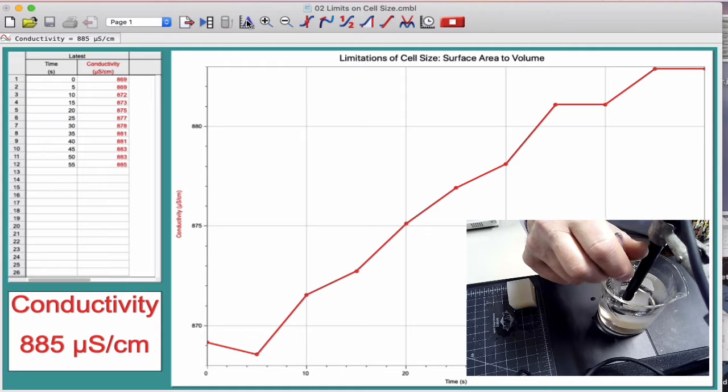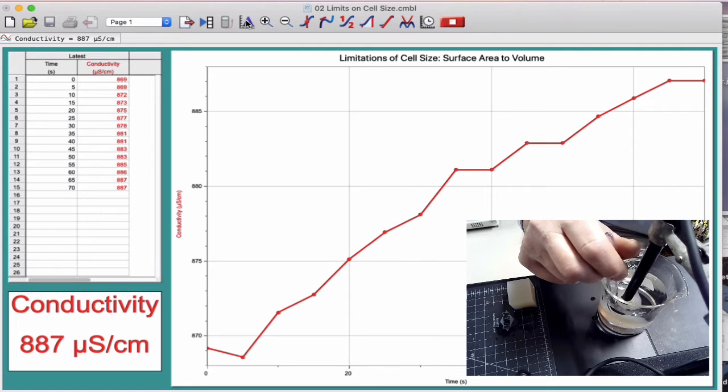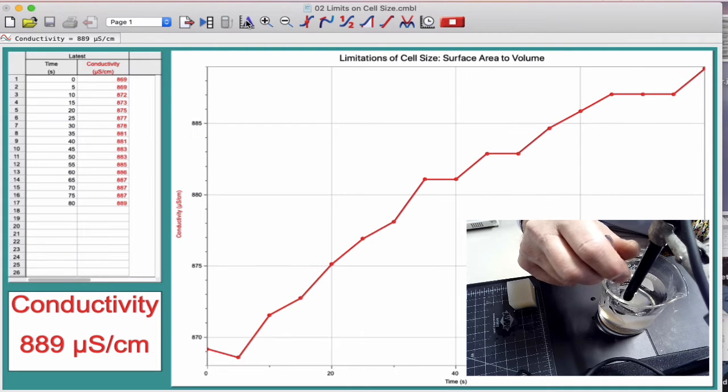So it's going to only do 20 different. The data is being collected. Not going anywhere. I'm just gently stirring it. I'm not going crazy. So already you should be thinking about what's the what-it-means for this graph. All right, so what I see and what does it mean?